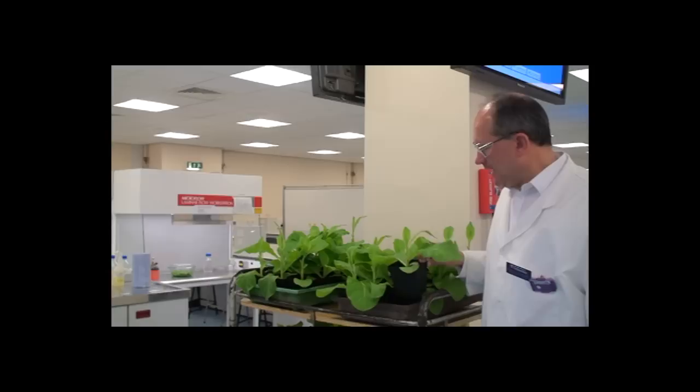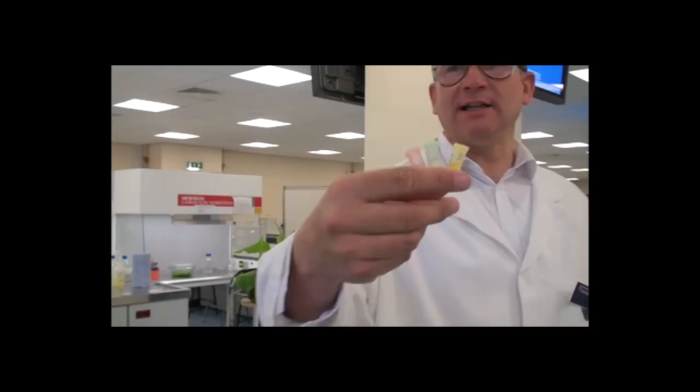And then in the second part, we'll be looking at how different Agrobacterium bacteria, which I have in the little tubes here, will be able to induce carrot cells from sections of carrot root to divide. Now let's start on the practical.